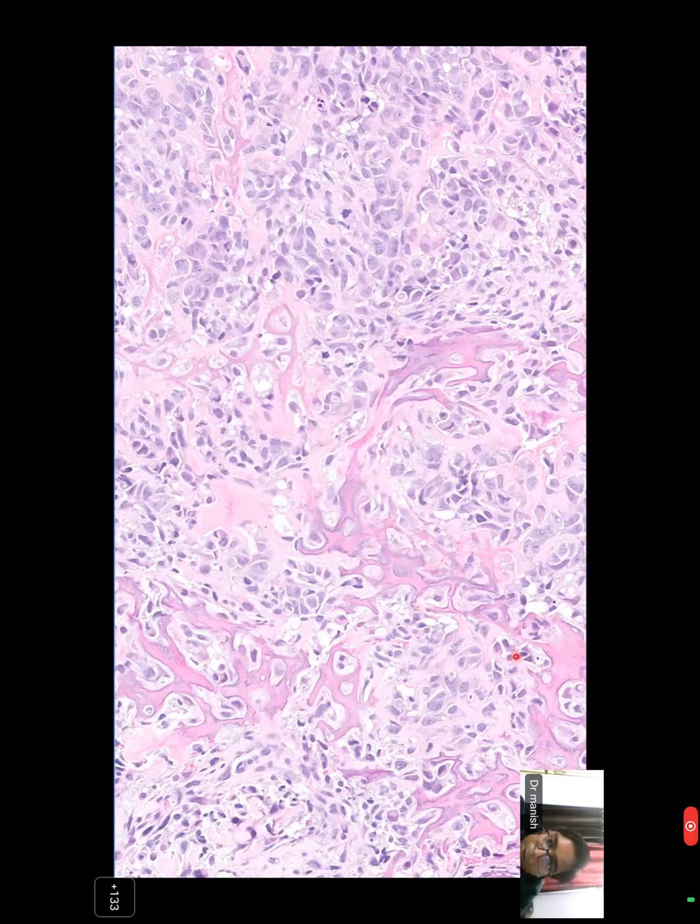Let's come to that. So I think this is osteoid, and one of the issues you'll often bump into, and sometimes it's impossible to tell, is: is this collagen? Collagen can look very pink as well, or is this osteoid? Now, if it's mineralized, and I think you get a sense that this is a little bit mineralized because it looks bluish, that helps make this osteoid. But even more importantly, collagen, fibrous tissue, is never laid out in this fashion. You see this sort of filigree, lace network.